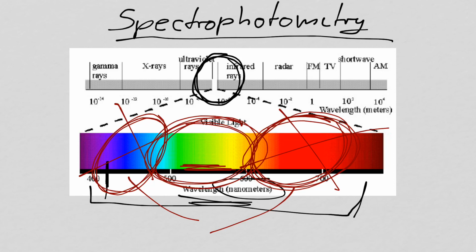What happens in this case is that there is some absorbance still in this range here, and no longer absorbance in the red light area, and that is why leaves in autumn turn red. So you learned something.